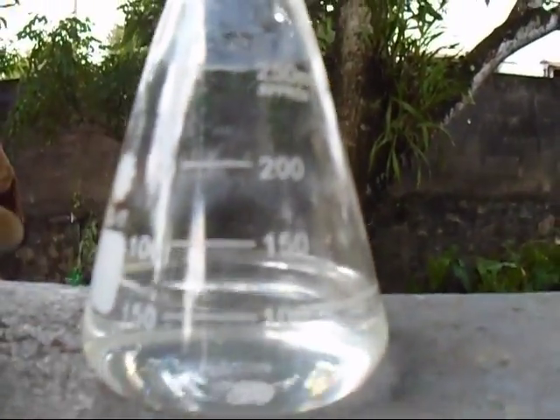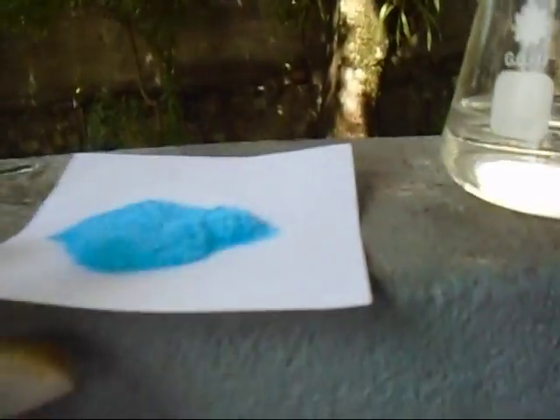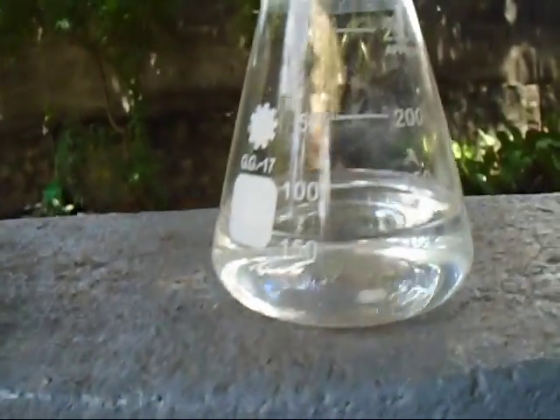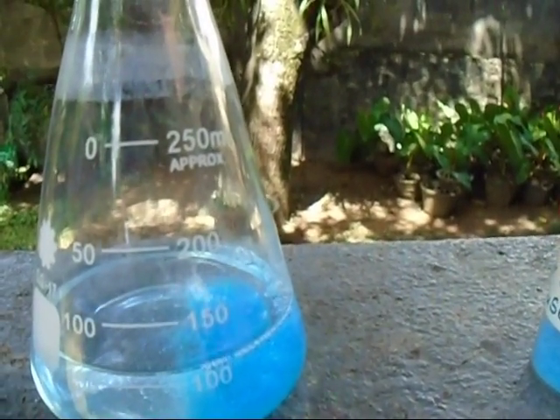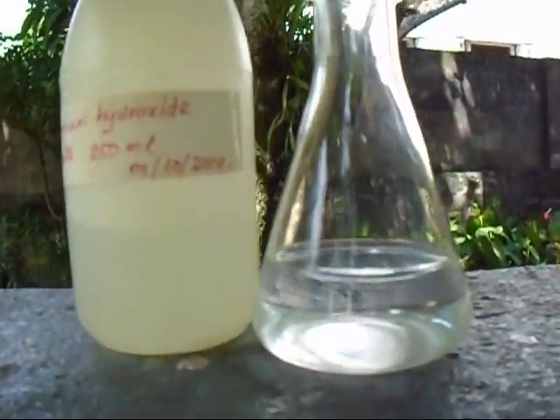First we want 100 milliliters of water, then I add five grams of copper sulfate to the water and dissolve it. Here is the copper sulfate solution.